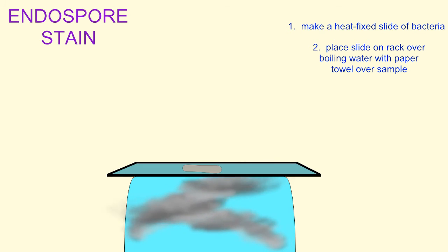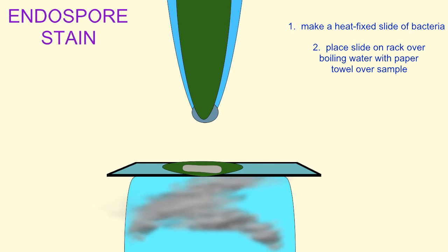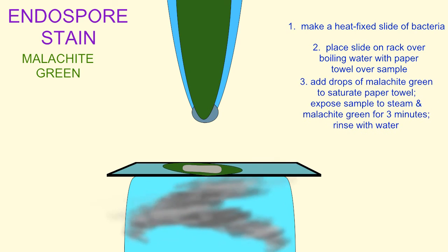While over the boiling water, a paper towel absorbs drops of malachite green. This malachite green is then encouraged to enter not only the cells but the endospores because of the hot temperatures from the steam.